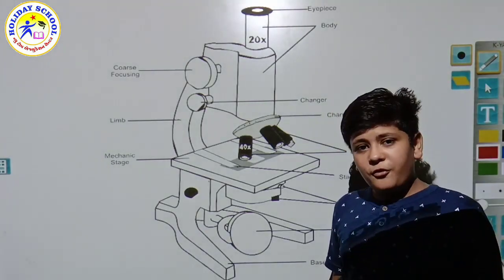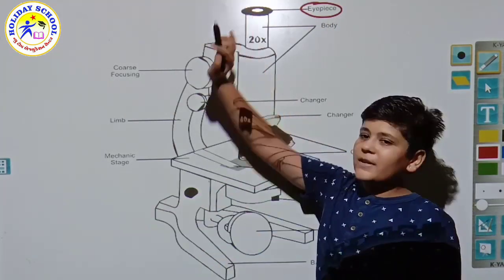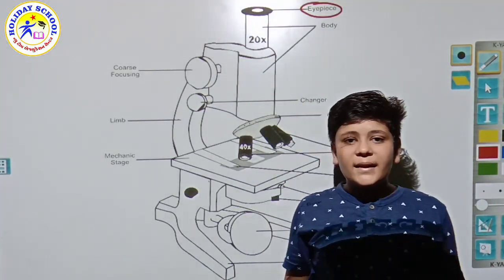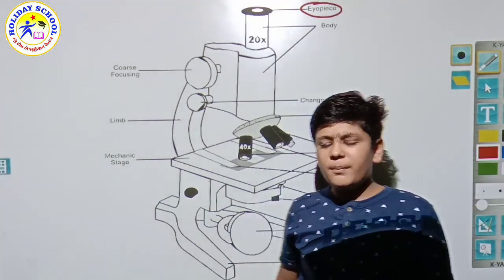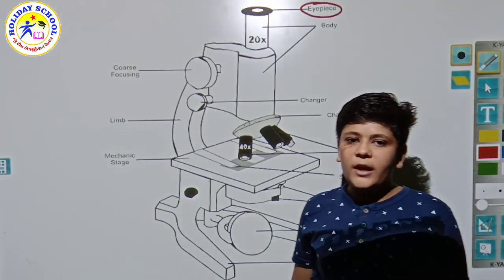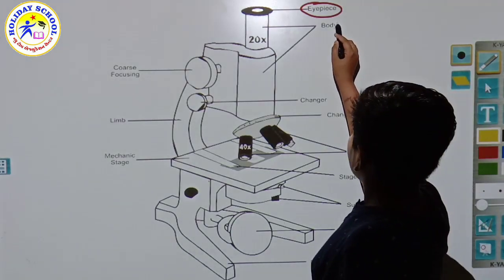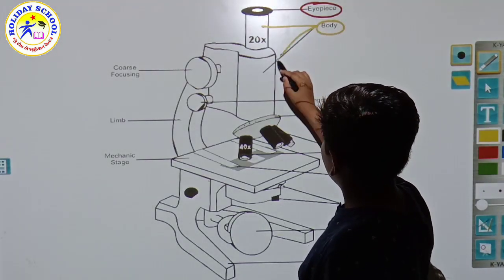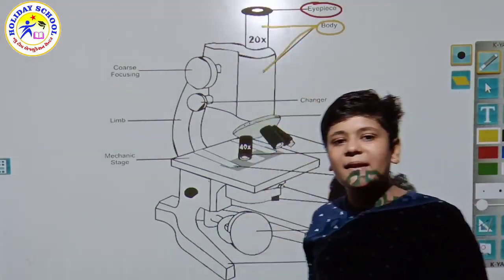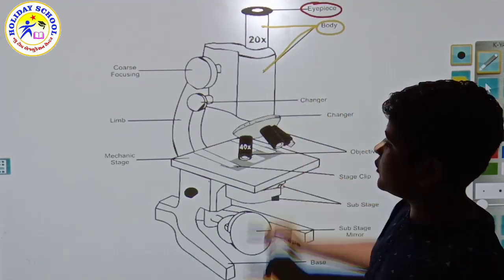Friends, first of all you can see here the eyepiece - this black colored part. From that we see things, like an onion peel or any leaf. After that, here is the body. Here there is a lens which is a 20 times zooming lens. This is the body of the microscope.